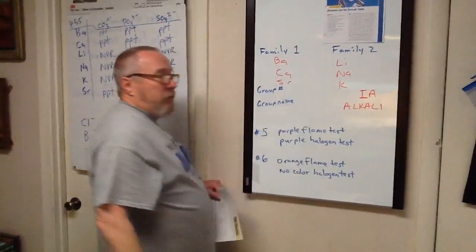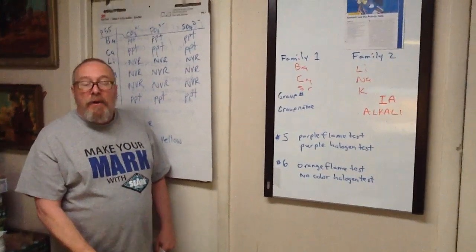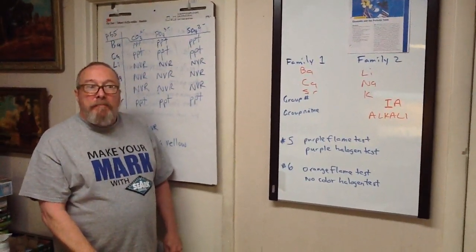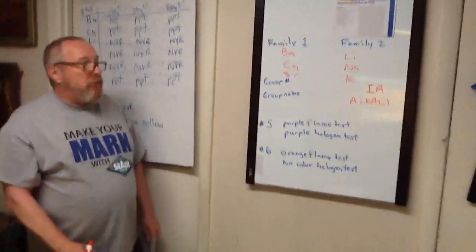Because when you react them with water, they react very violently, and I'll do a demonstration of that with water. When you react them with water, they form an alkaline solution.